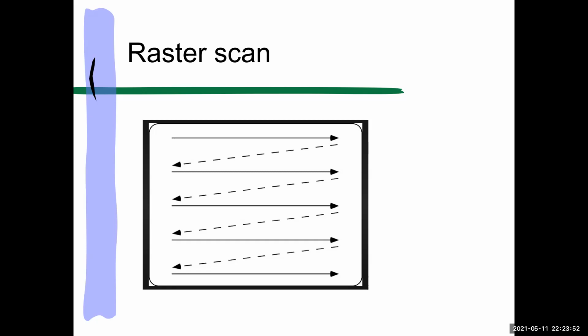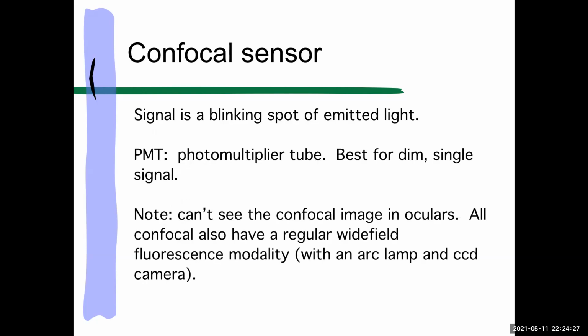Whereas now confocals are used even by my optometrist who has a medical version of it to scan my retina, you know, presses a button, everything's automatic. So to go from a specialty instrument to something widely used all over the place took a lot of innovation. And it really happened thanks to fluorescent proteins driving the need for confocals. Confocals, in truth, are better at fixed specimens, but they can also be used with modifications for live specimens, by the way.